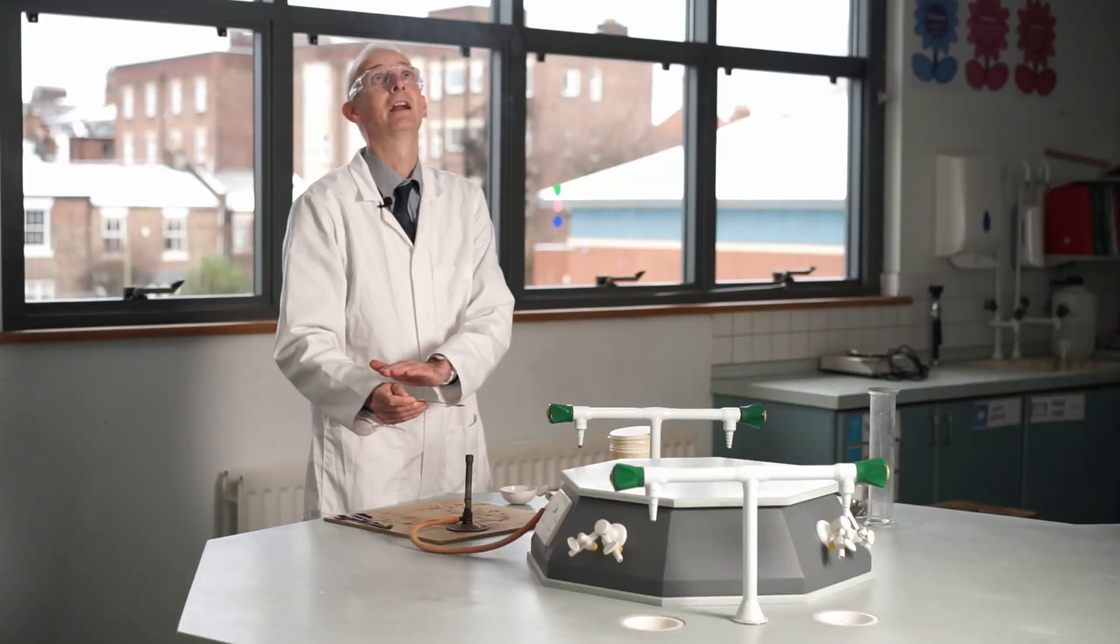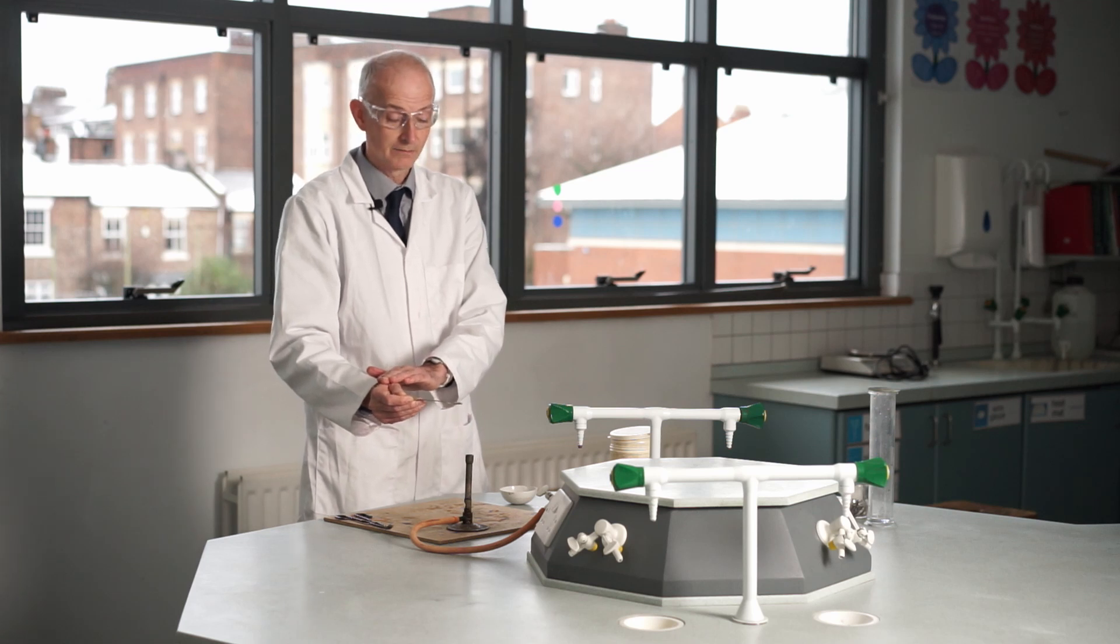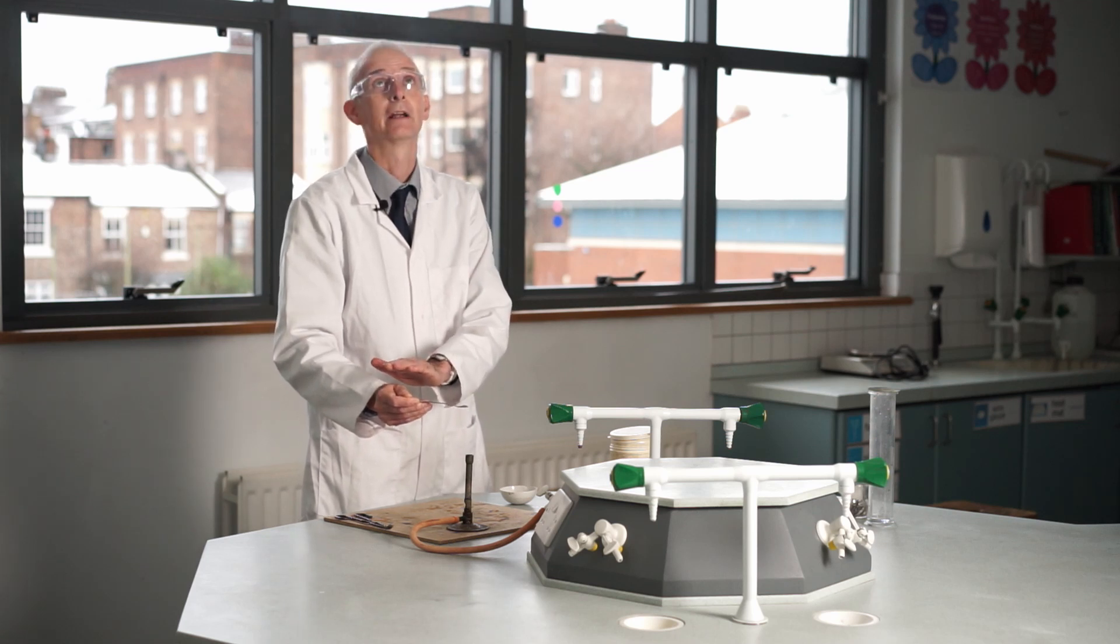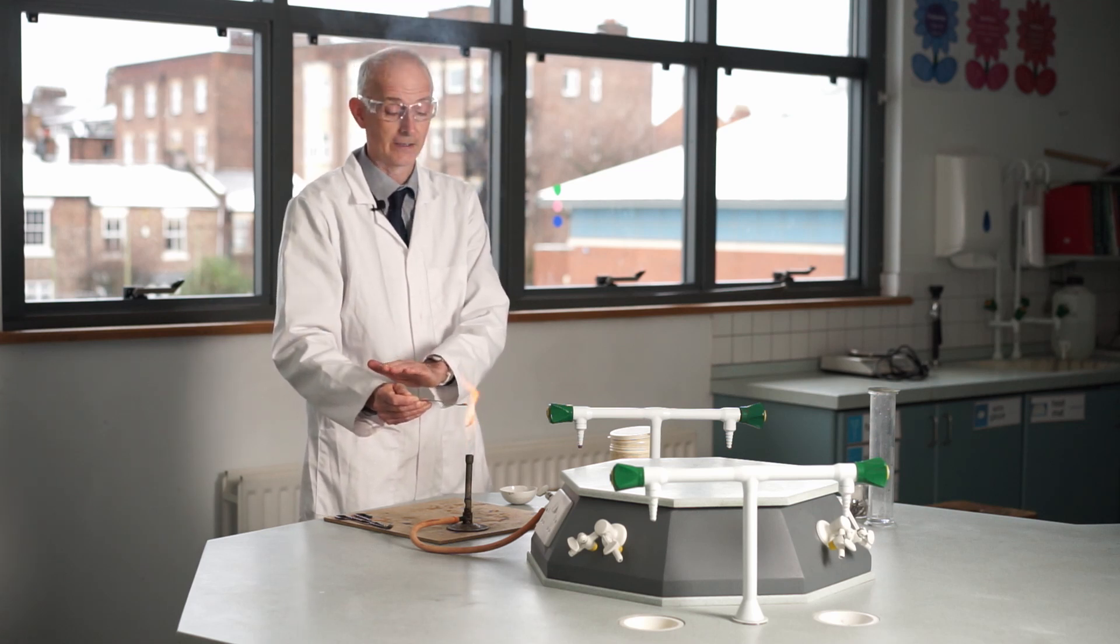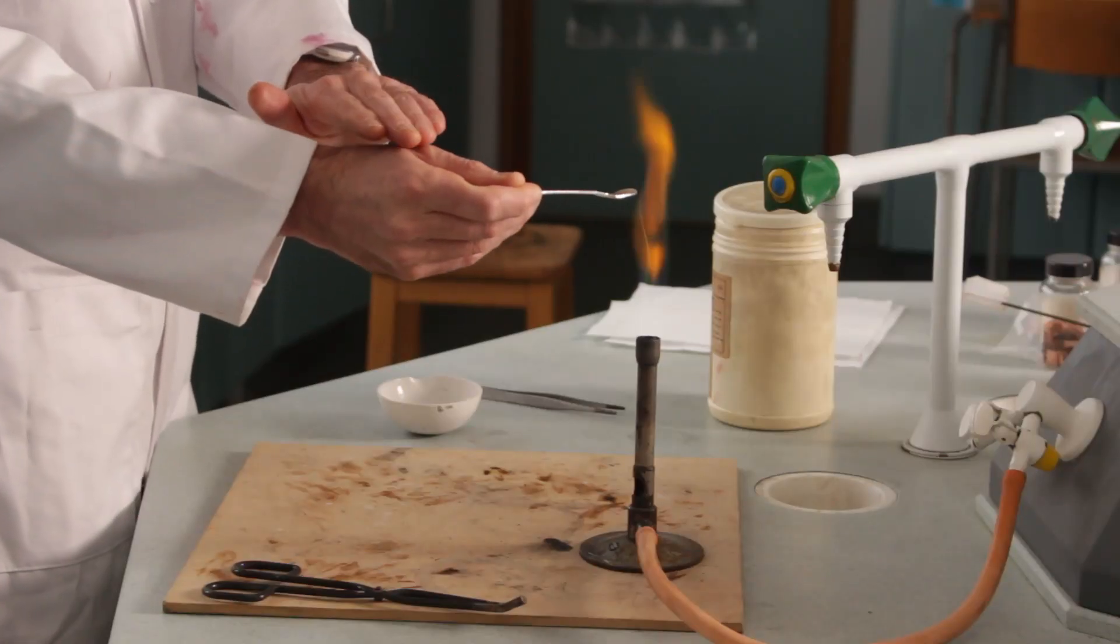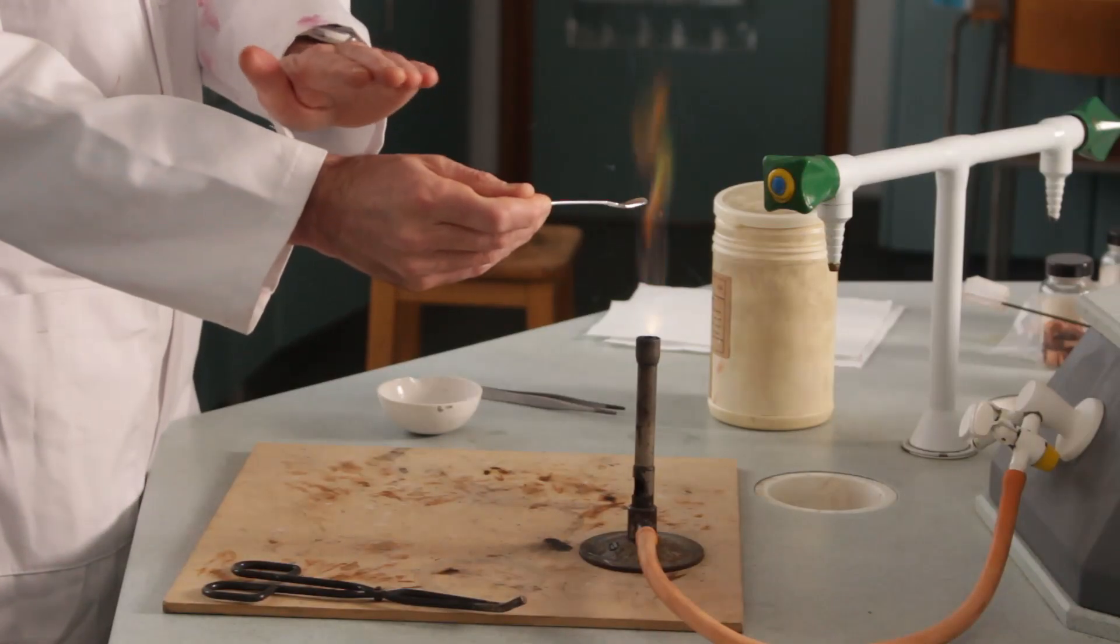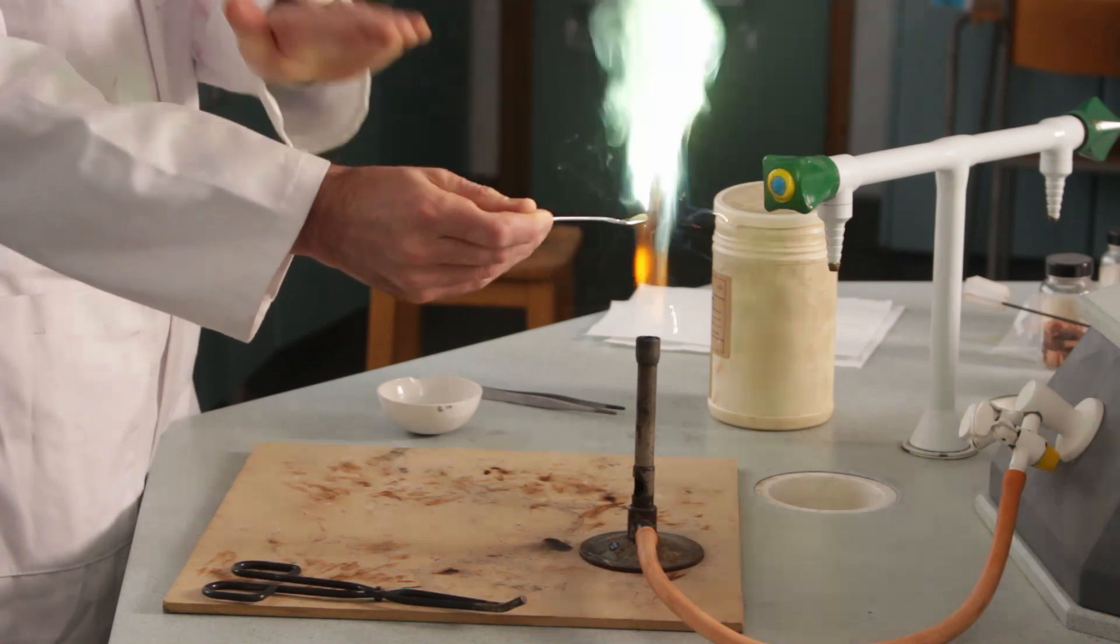It's a nice fine gray powder, and then when I whack it into the flame it ignites with a kind of greeny flame and we get this white smoke being produced. It's reacting with oxygen, so that white smoke is zinc oxide coming off. A nice green flame and then white smoke.